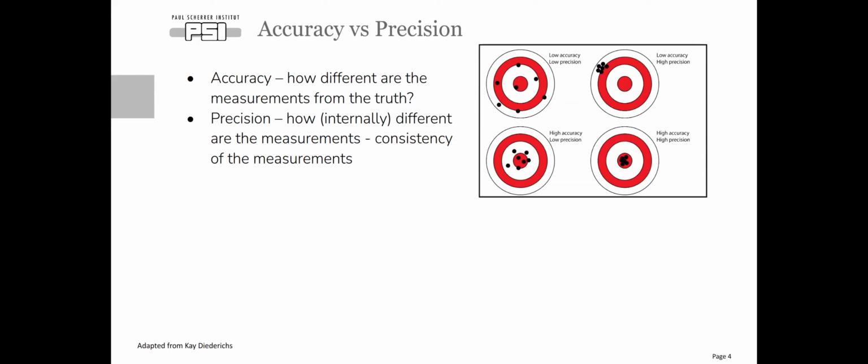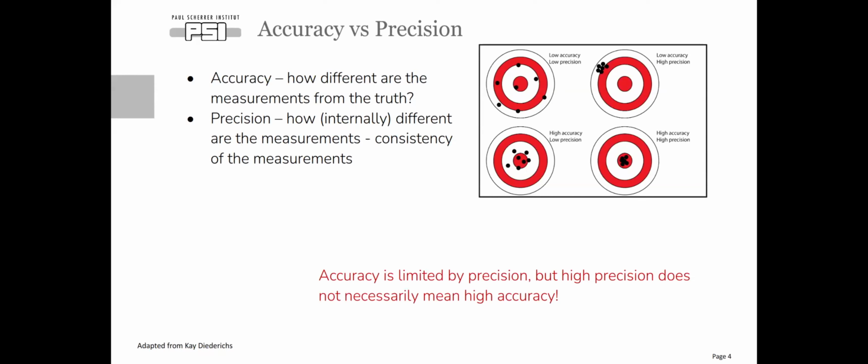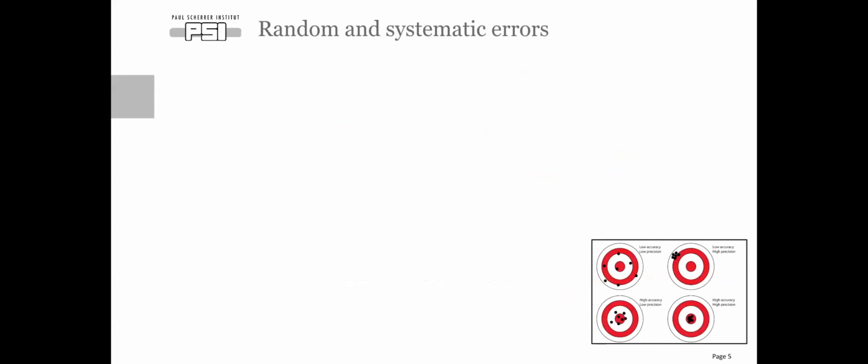And from that, we can see that accuracy is limited by precision, if you have a look at the picture. But high precision does not necessarily mean that we are close to the truth, so that we also have a high accuracy. So I think it's really important to understand that. And now, in our previous talk, Graeme was talking about uncertainties or errors. Sorry, I call it errors, but I want to relate this accuracy and precision problem to the errors that we actually have in the data set.